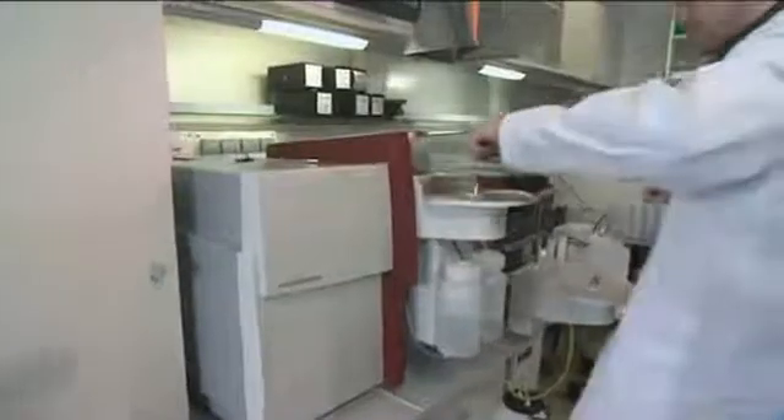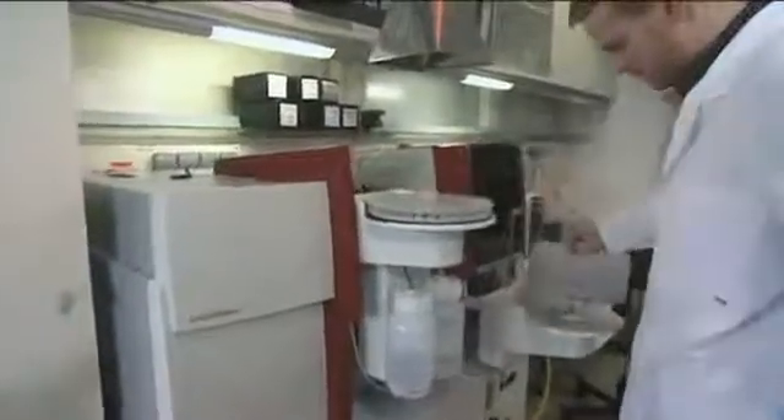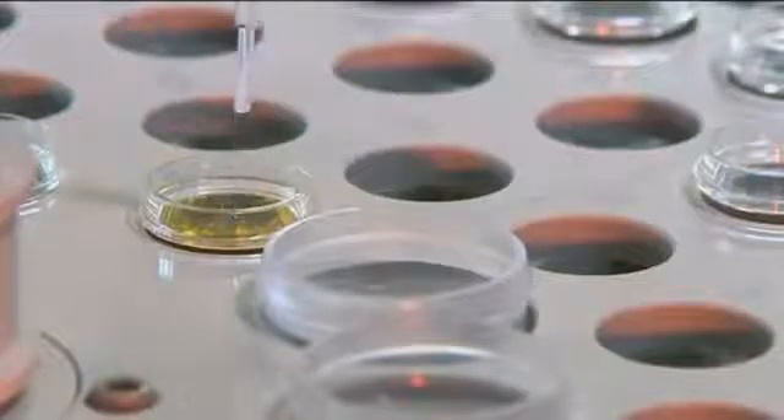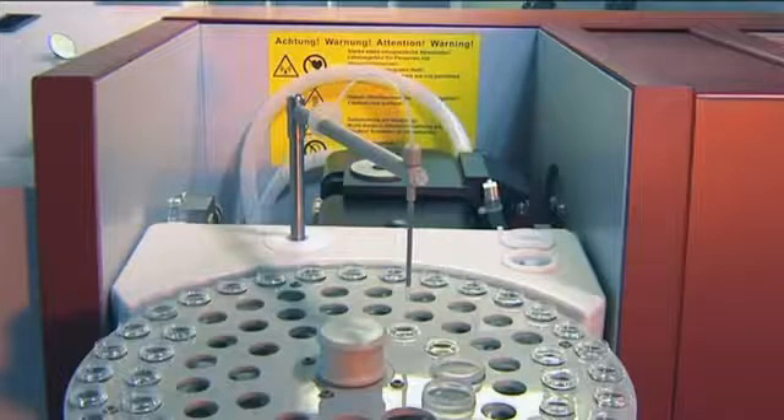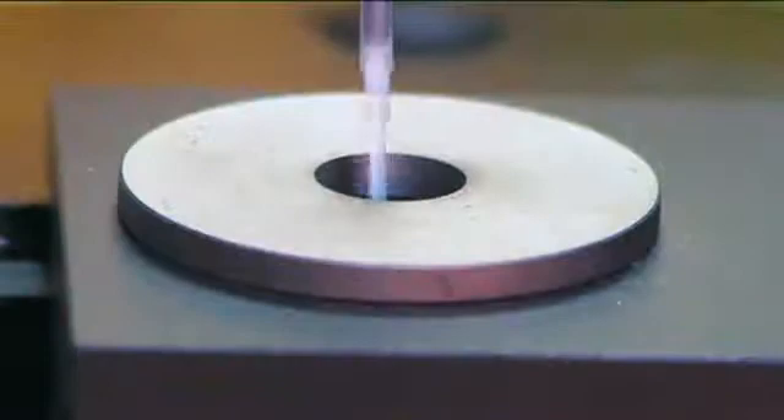The micro pipetting unit takes over the preparation of the calibration standards and if necessary the dilution or concentration of samples in the graphite furnace. The turntable with 89 positions enables large sample series to be measured automatically. Pyrolytically coated transverse heated graphite furnaces create optimum atomizing conditions even for demanding samples.